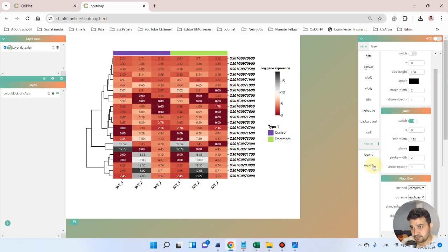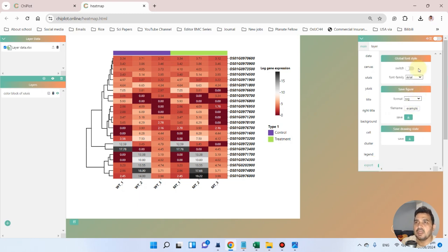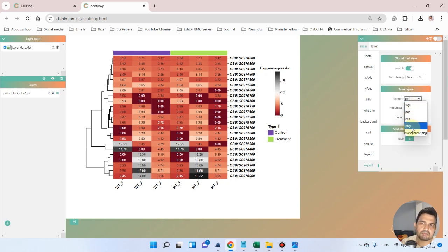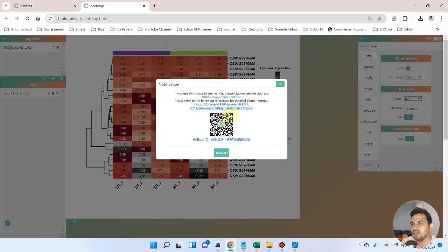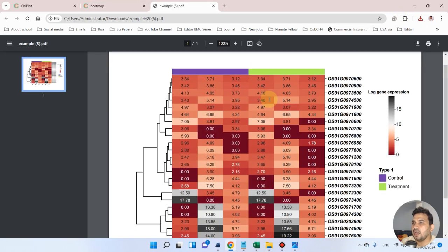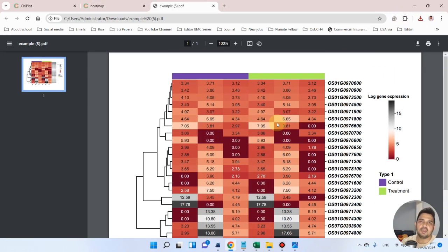Finally, if you want to export the plot, you can change the font — for example, back to Arial. Then select the format: you can save it as PDF, PNG, or transparent PNG. Let's save it as PDF and click download. A high quality heat map is ready and you can directly use it.